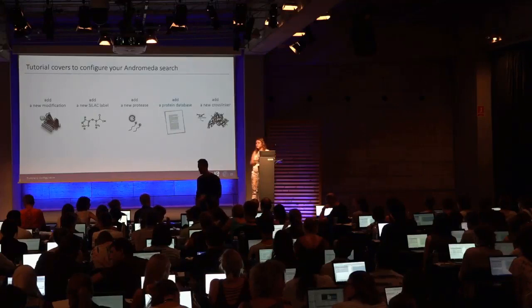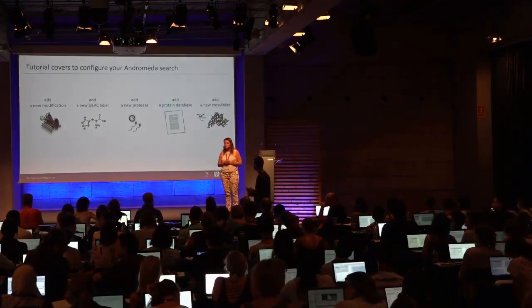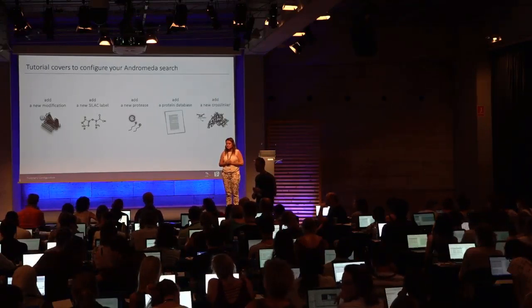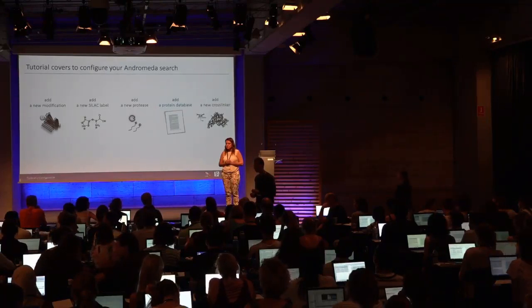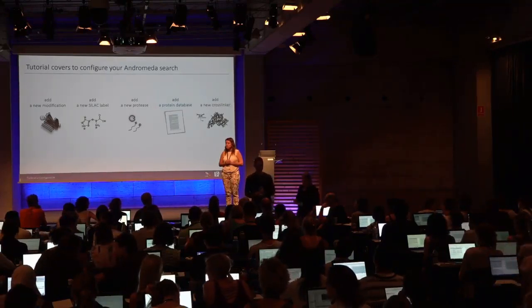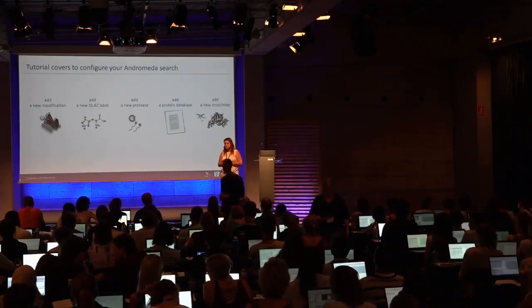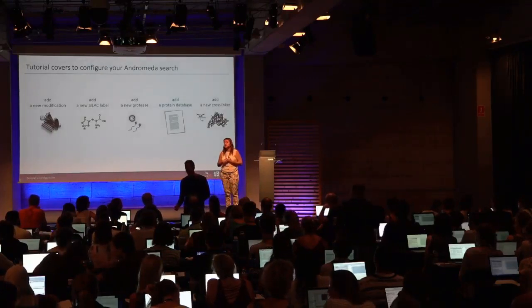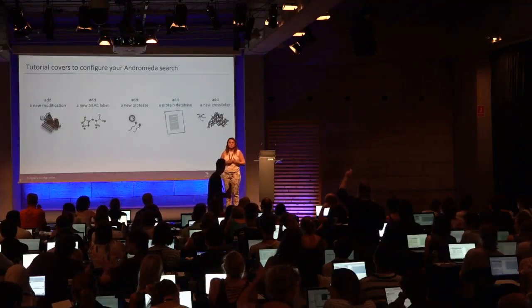Yeah, just one last question, for the future. It would be nice if one could import the Unimod modifications instantly, but there are only like 500 modifications in the database. Instead of copy-pasting information, that's just a suggestion for future improvement. Okay, I understand.